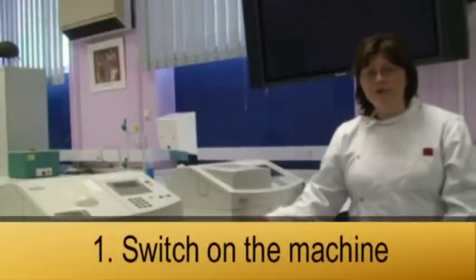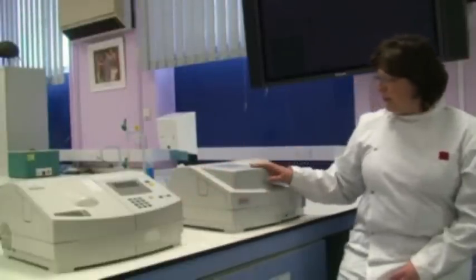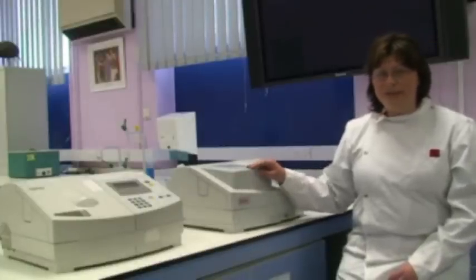Hello, I am going to show you how to use the spectrophotometer. There are two spectrophotometers from different manufacturers. You will find them in the labs, but they measure both the same thing.